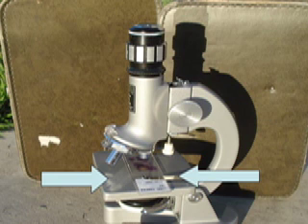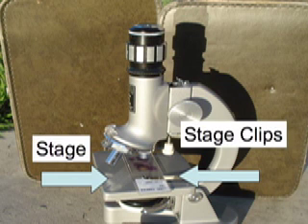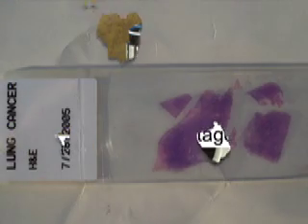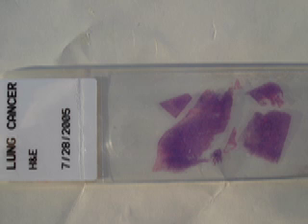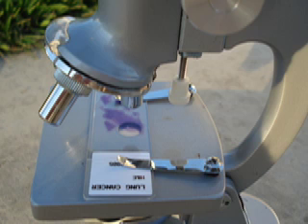The stage and the stage clips hold the specimen steady. Slides come in many varieties — sometimes we'll make slides, sometimes they're prepared. When we're ready to examine a slide, we place it on the stage and secure it with the stage clips.